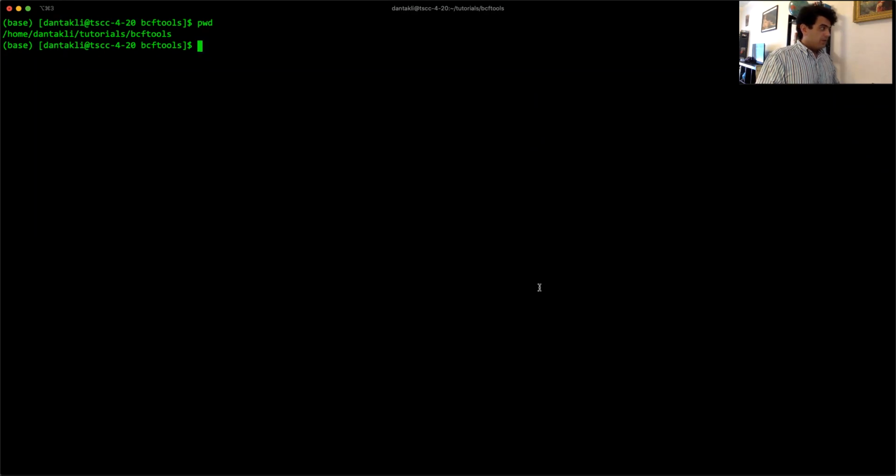So basically, I'm going to show you guys how to use BCFtools. Feel free to follow along. Hopefully you've installed it. It's a really powerful tool. I think I pretty much use it almost every day. And essentially what it is, it's a program written in C, so it's extremely fast, and it's designed to work with VCF files.